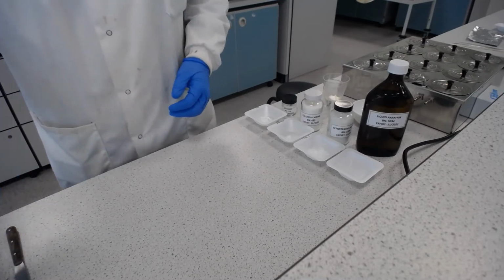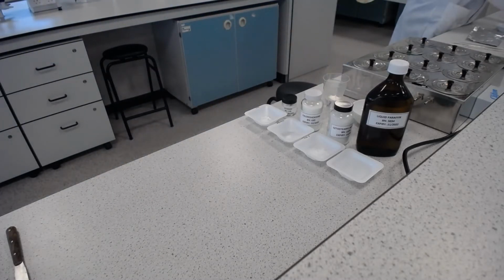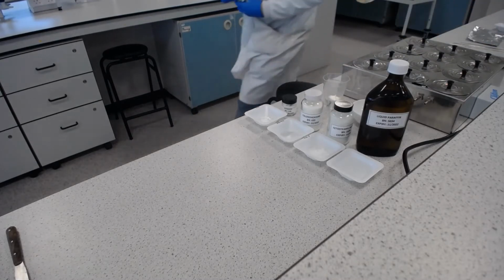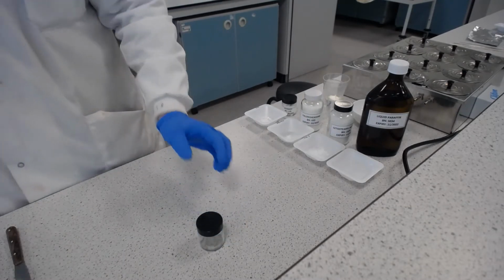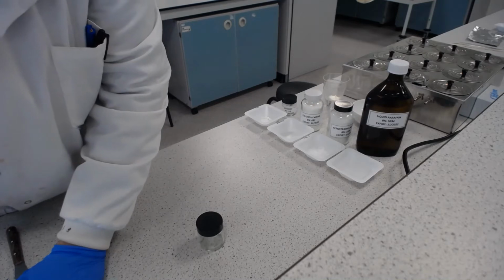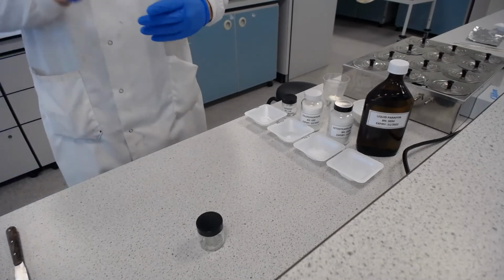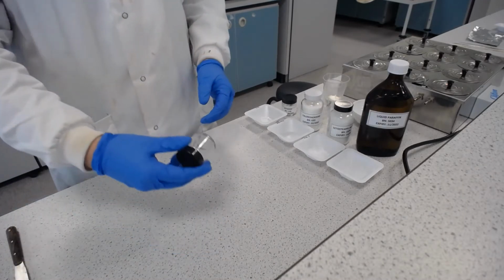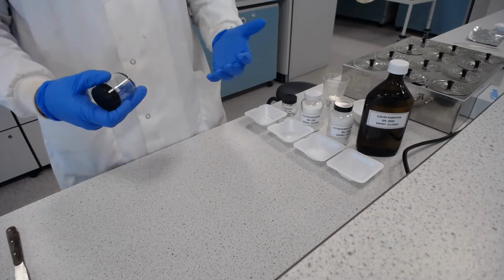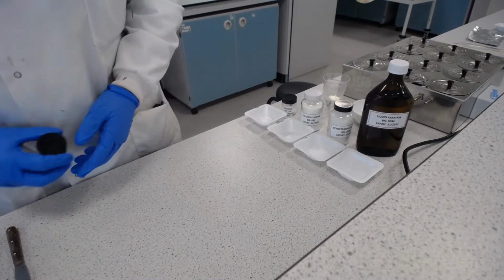So I've not done that yet, so I'll just go and do that now. And it weighs 52.3 grams. So I'll just make a note of that on my worksheet. So we need to know that so that when we come to the end and we're putting the cream into the pot, we know exactly how much cream we've got in there, and we can work out the difference in mass, which will tell us how much cream there is.